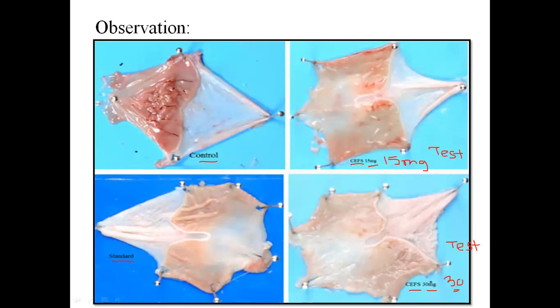Now see, I can consider this as the total area. And now this is your ulcerative area. So this area may be 50 and this area may be 10. Then multiplied by 100. So this will come around 20%. So this is your ulcerative index.